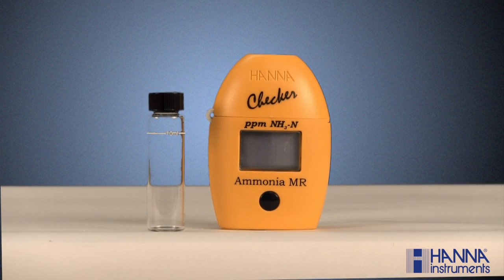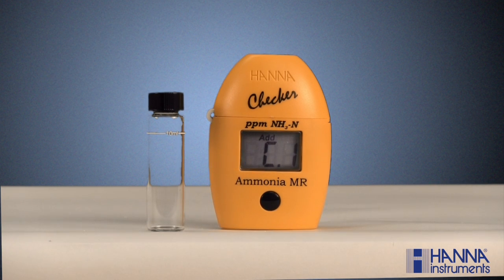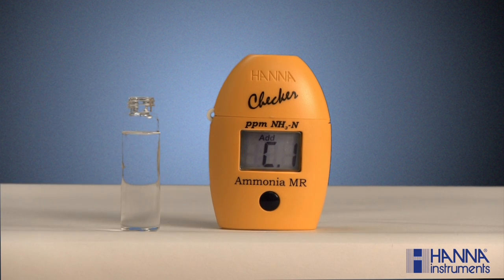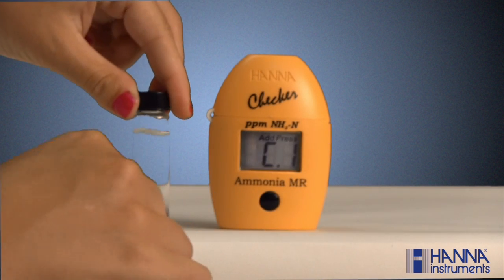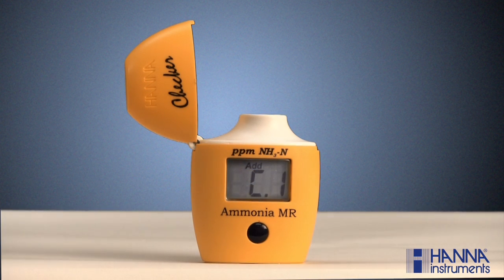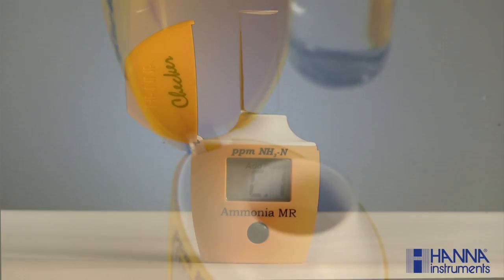Analyzing a sample with one of our Hanna checkers is fast and easy. First, turn the checker on by pressing the button. After all the segments are displayed, C1 and the word 'add' will appear on the screen with 'press' blinking in the upper right-hand corner. Next, fill a cuvette with 10 milliliters of unreacted sample and replace the cap. Make sure the cuvette is dry and void of fingerprints by wiping it down with a lint-free cloth, such as our HI-731318, which is sold separately. Place the cuvette in the checker, aligning the break in the cuvette's 10 milliliter line approximately with the hinge of the checker, and close the cover.